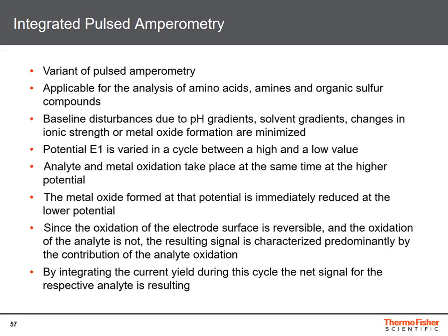Since the oxidation of the electrode surface is reversible and the oxidation of the analyte is not, the resulting signal is characterized predominantly by the contribution of the analyte oxidation. By integrating the current yield during this cycle, the net signal for the respective analyte results.